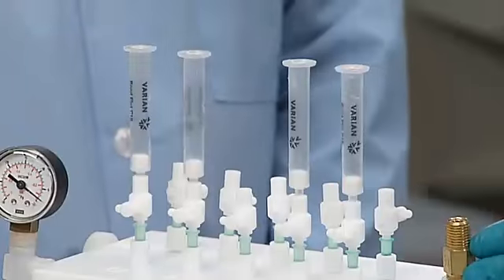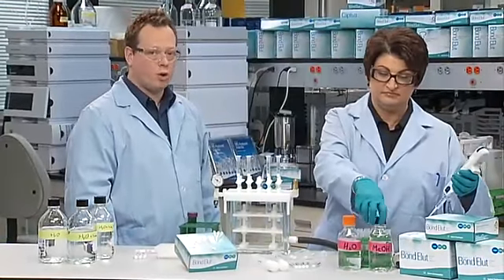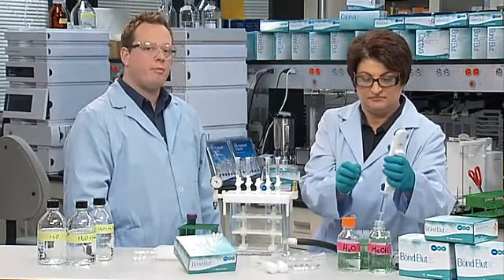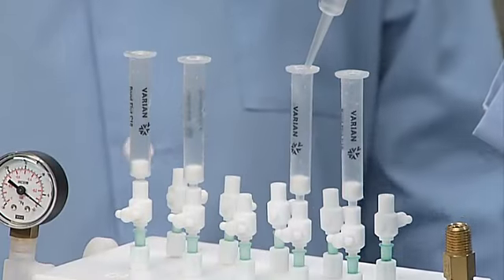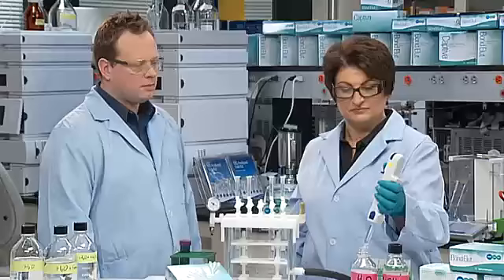We have chosen this bed mass to allow us to visualize and explore the concept of proper conditioning. But keep in mind that poor conditioning is an issue no matter what the bed mass. In general, it's appropriate to use 3 to 5 bed volumes of solution or solvent per bed mass. For example, if the bed mass is 100 milligrams, then use 300 to 500 microliters of solvent.